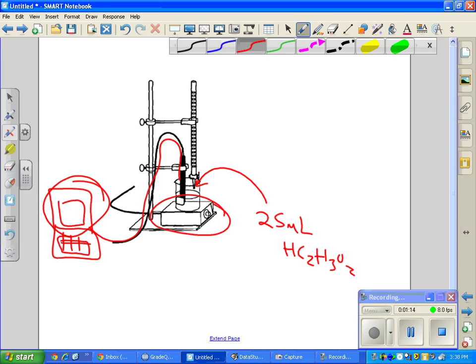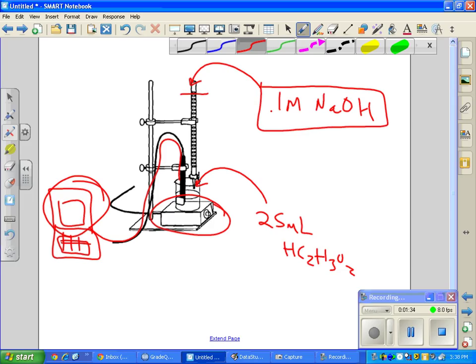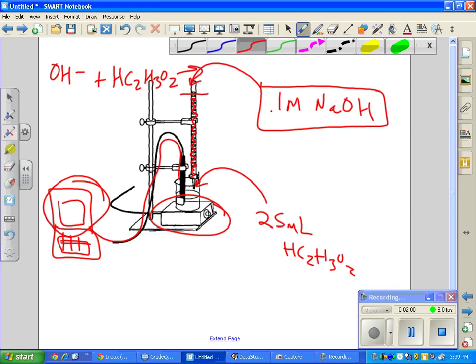You're also going to use sodium hydroxide. The burette — a volumetric dispensing device — you're going to take 0.1 molar NaOH and fill the burette to right around zero. It doesn't have to be exactly zero, but ideally starting near zero makes it easier to read. Then you're going to titrate the acid with the base; our titration equation is OH⁻ with HC₂H₃O₂.